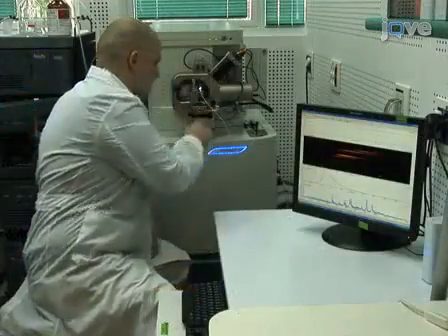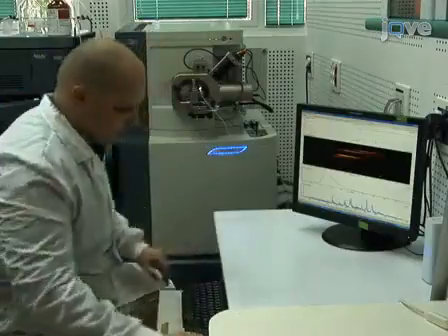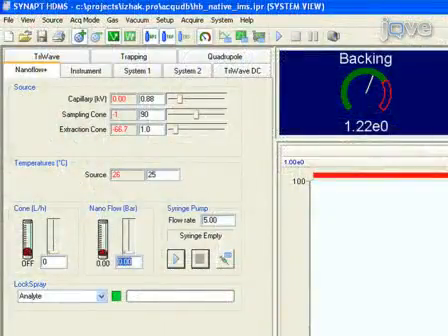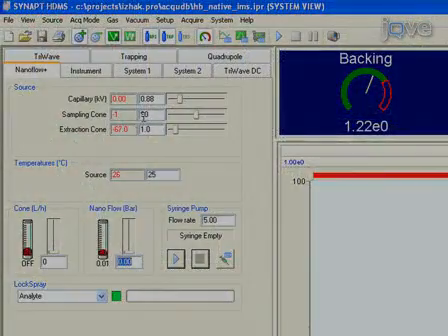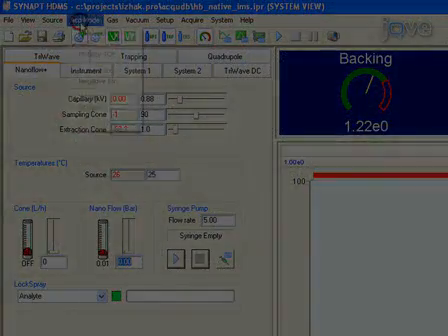To begin this procedure, set the travelling wave, or T-wave, Synapt IM-MS instrument to the following modes of operation.